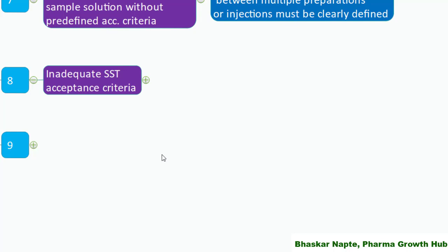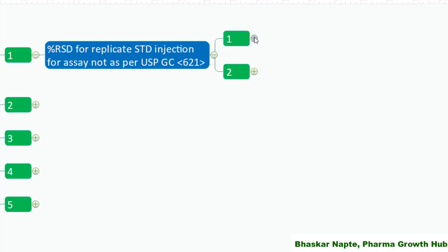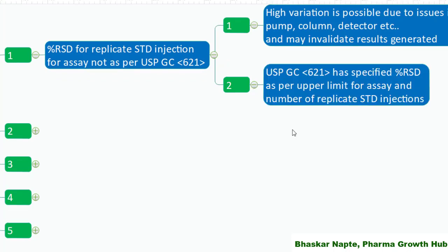Inadequate system suitability acceptance criteria — specifically, percent RSD for replicate standard injections for assay not set as per USP General Chapter 621. USP General Chapter 621 describes how to set the system suitability acceptance criteria for percent RSD for standard replicate injections based on the assay upper limit and the number of replicate injections. It is very important to set the acceptance criteria for percent RSD in line with General Chapter 621.